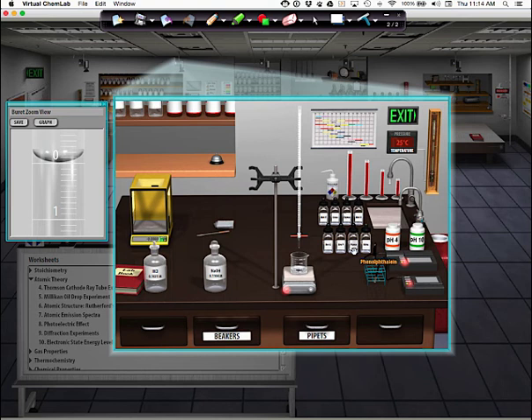So here's how you do it. Let me zoom out just a little. What you're going to do is you're going to grab the phenolphthalein and it gives you the dropper. Now, guys, watch and listen very carefully. Sneak up on this from the bottom, and again, it takes the dropper away from your hand. But what do you have to do to get it to add? Let go. But guys, watch and listen. When I let go, nothing.